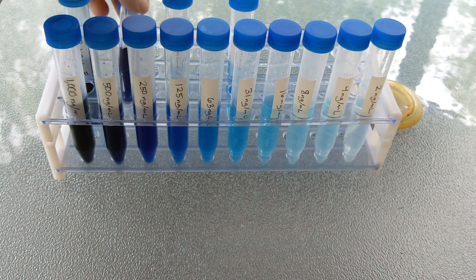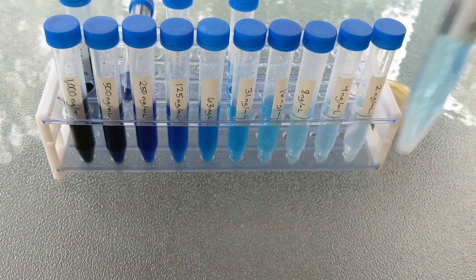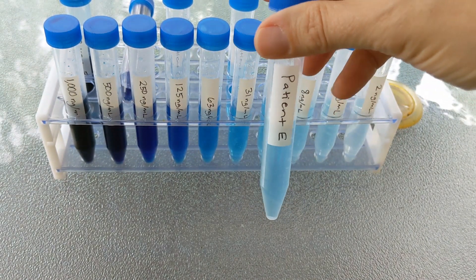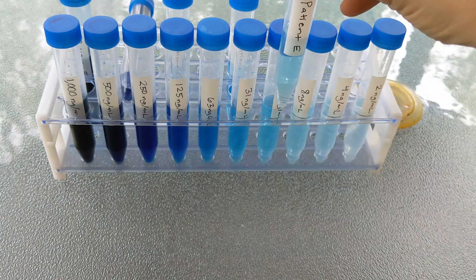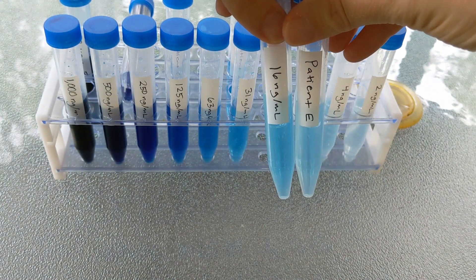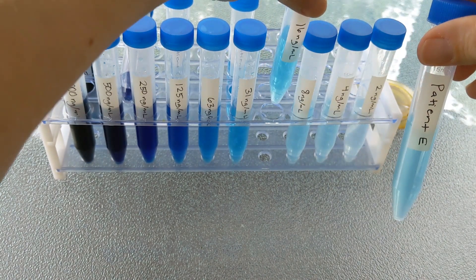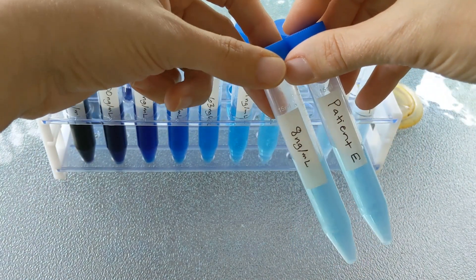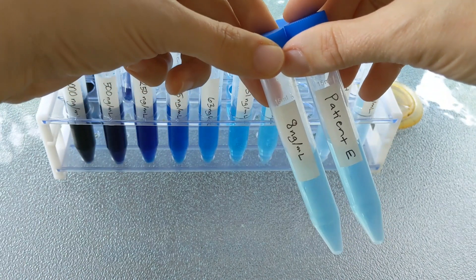And then I have patient E. Patient E looks to be infected, but the infection level is definitely lower than the other patients. I think it's less than 16 even. There we go. Eight nanograms per milliliter.